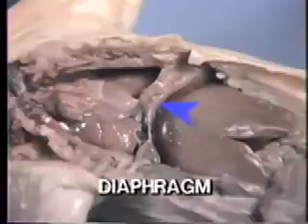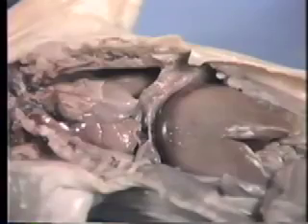The diaphragm is a bell-shaped muscle that separates the abdominal and thoracic cavities. In an undissected animal, the diaphragm is attached around its perimeter to the body wall and forms the bottom of an airtight chamber that contains the lungs and heart. Movements of the diaphragm are partly responsible for the physical movements called breathing.